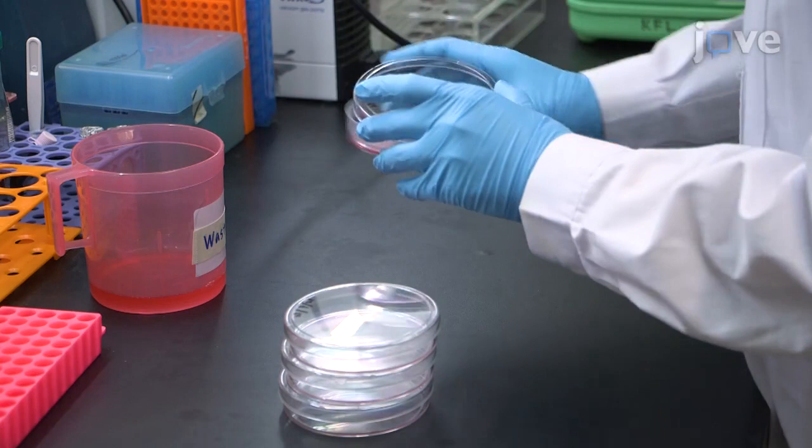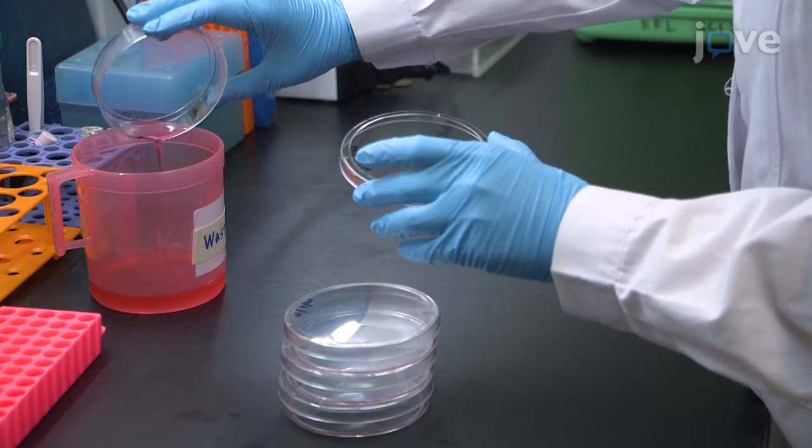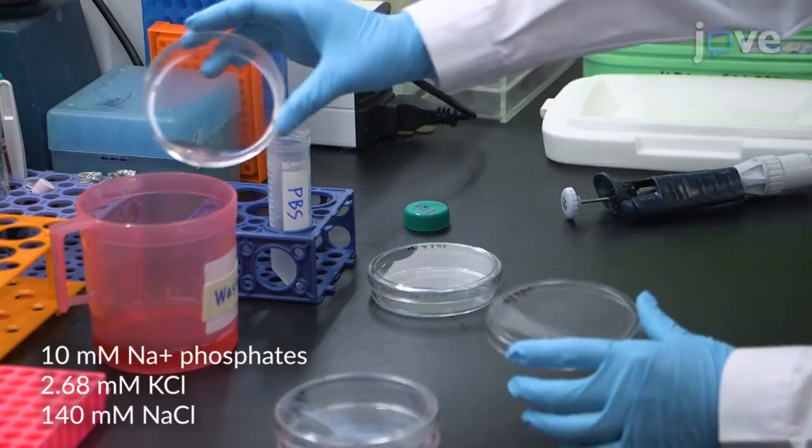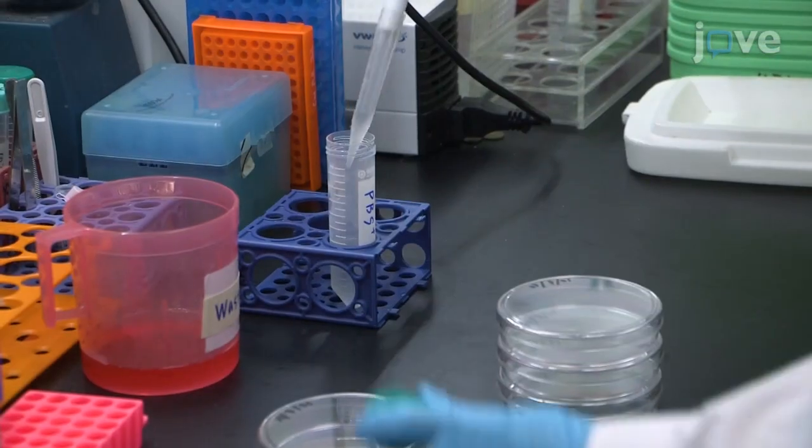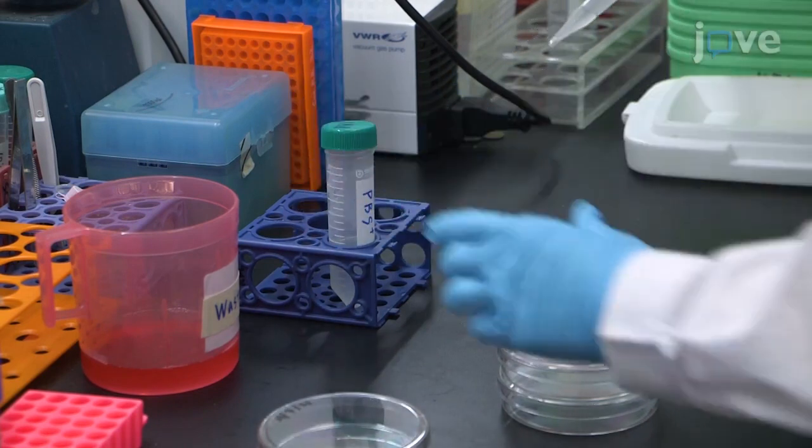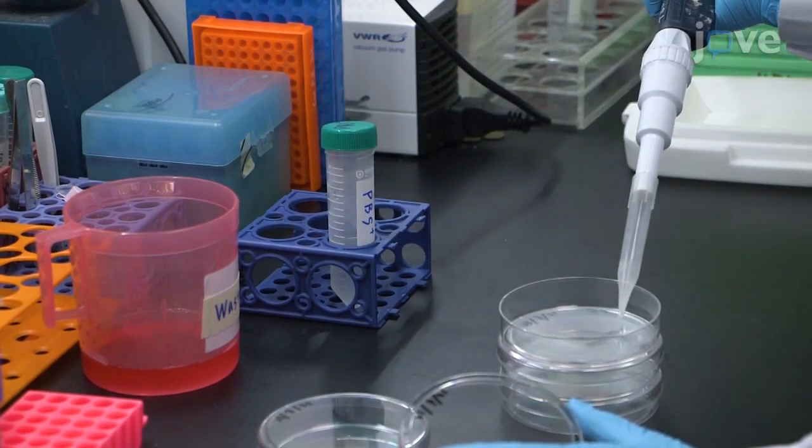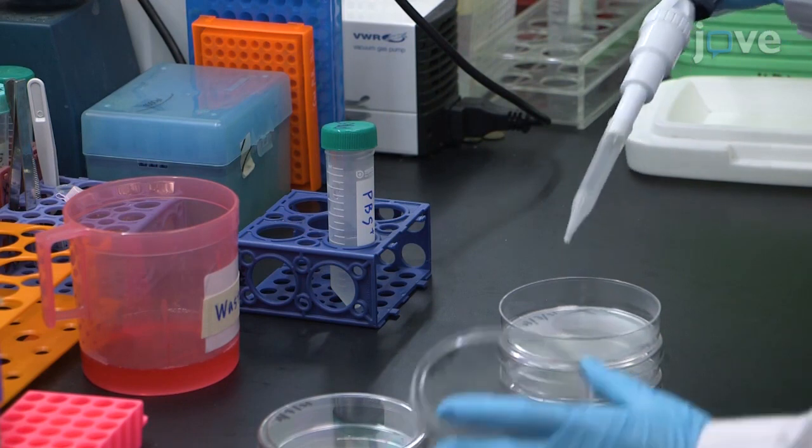To harvest the cells, discard the culture medium 48 hours post-transfection and wash the cells twice with ice-cold PBS. Then, add 1 mL of ice-cold PBS supplemented with 0.5x protease inhibitor cocktail and 0.5x phosphatase inhibitor cocktail to each dish.